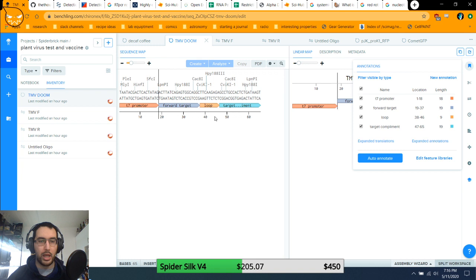And to do that, I'm going to make two or three different extracts from different organisms. One of them is going to be expressing the weird enzyme that I need. One of them is going to be basically the fuel and also all of the reagents that go into the reaction, because bio is metal, and why go to the store and buy reagents when I can just juice a bunch of bacteria? So that should make a bunch of RNA.